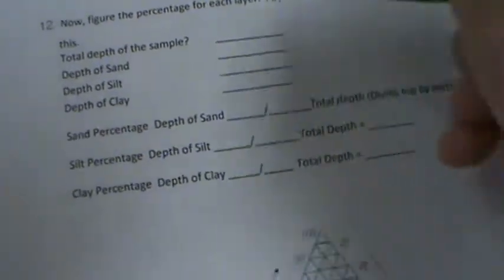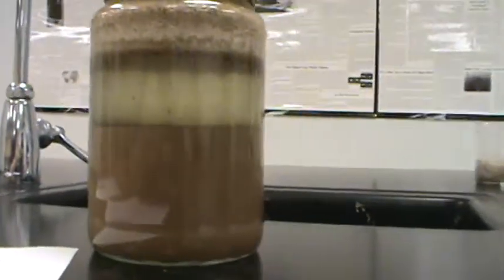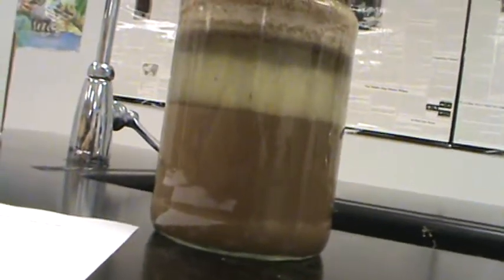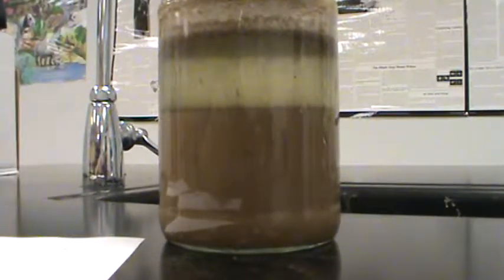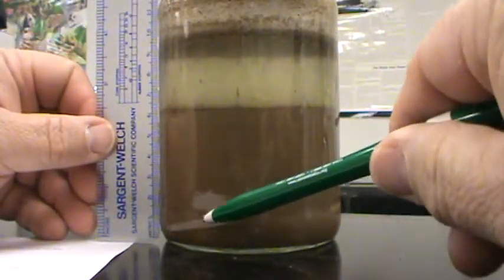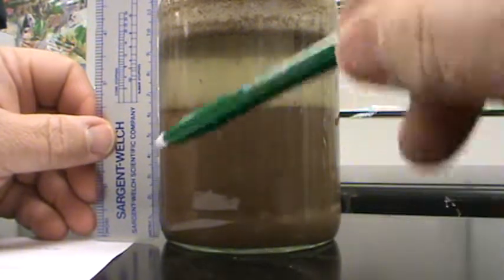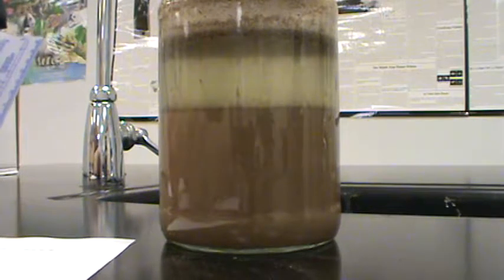It says the depth of the sample is 6 centimeters. Now it wants to know the depth of the sand. So I'm going to set you back down. We're going to measure each one, and then I'll take you through how we do the math. As I said, I'm seeing the sand layer go to right about here. This is about 4 centimeters. So the depth of the sand is 4 centimeters.